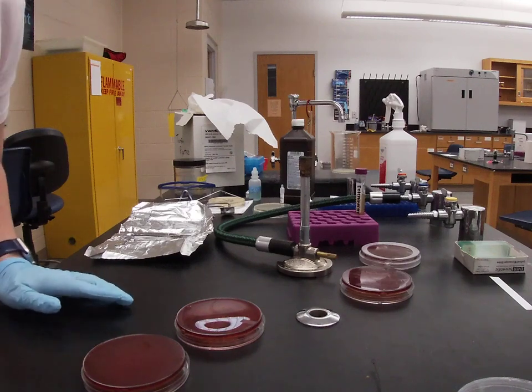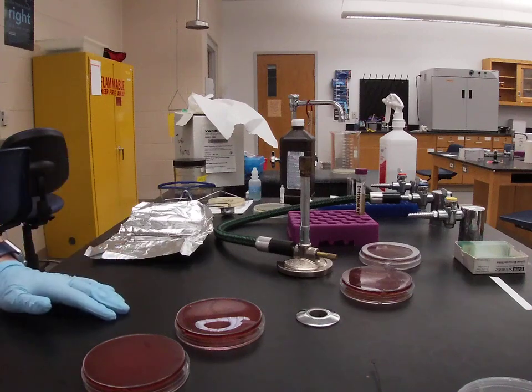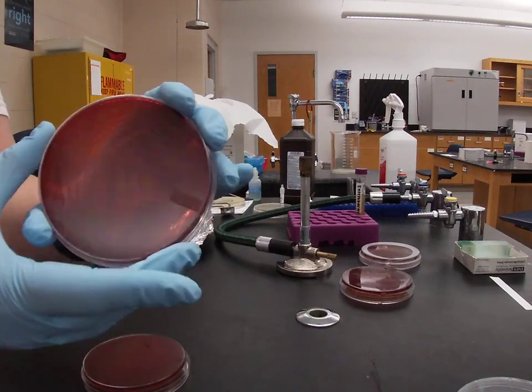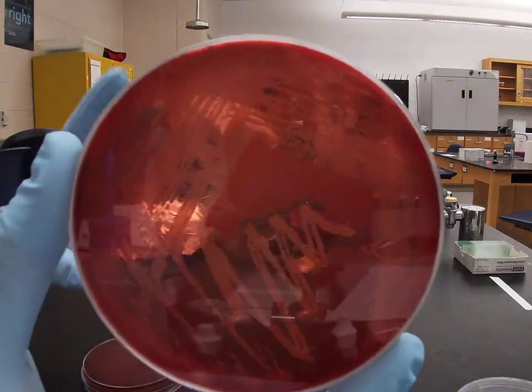The first one I'm going to talk about is actually beta hemolysis. Beta hemolysis is complete hemolysis. So bacteria that display beta hemolysis produce enzymes and proteins that they can use to lyse red blood cells. And they lyse all red blood cells that they come in contact with, and they lyse them completely. You can tell if an organism is beta hemolytic because they will actually cause clearing on the agar.